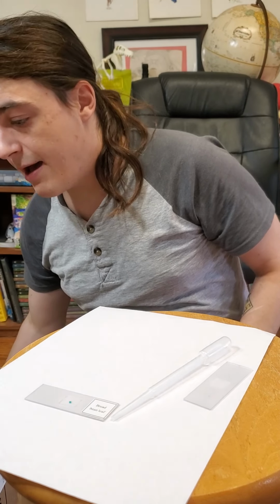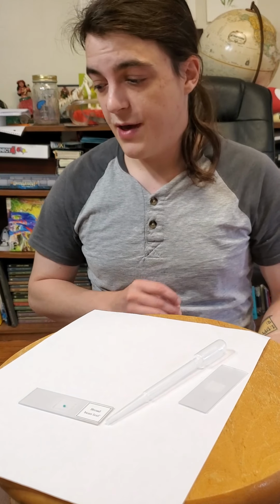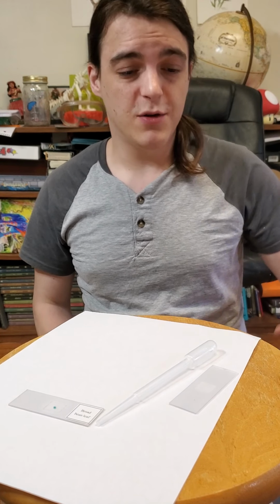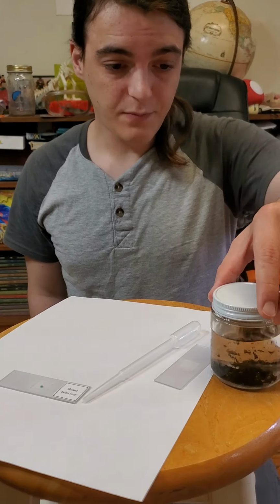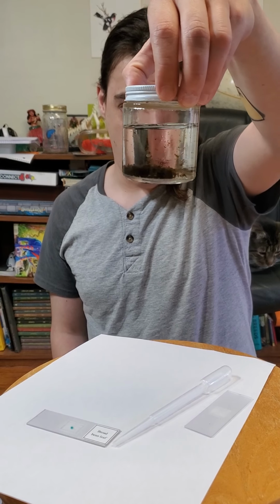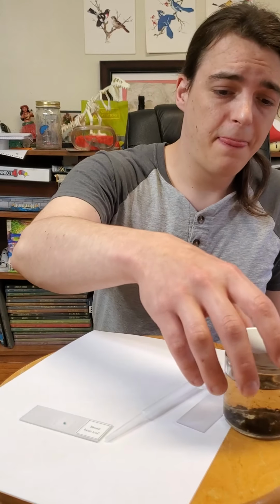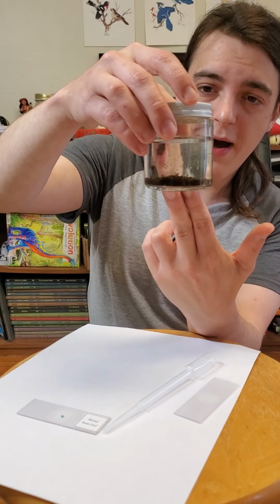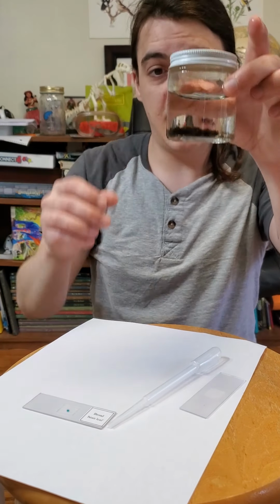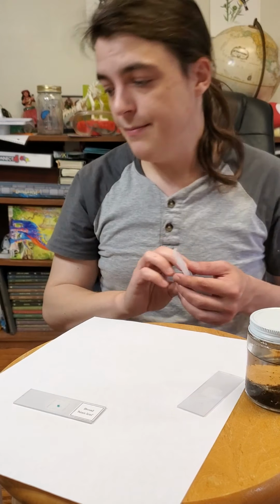And we are going to look at a handful of things that you might find around the house, very simple things, that are going to look really different when we zoom them in. So we're going to take a look at how they look different. Right here I got some pond scum. I know we were talking about when we were going to do the aquarium video, a little bit of aquarium water looked really clear. And I was talking about how if you get to a pond, you'd be amazed at the type of stuff you can see when you get some of that pond water. We're going to take a sample of pond water. I'm going to use my pipette to suck up some of that water and plop her on a slide.